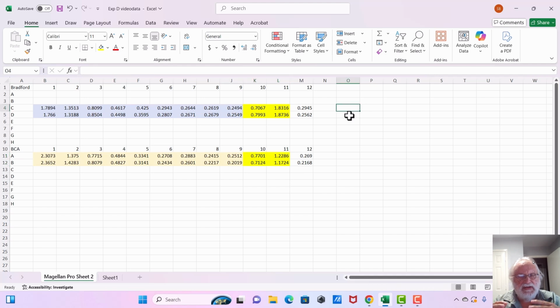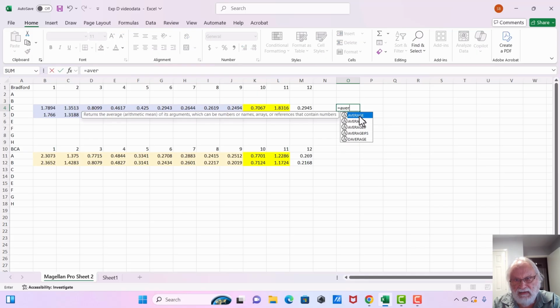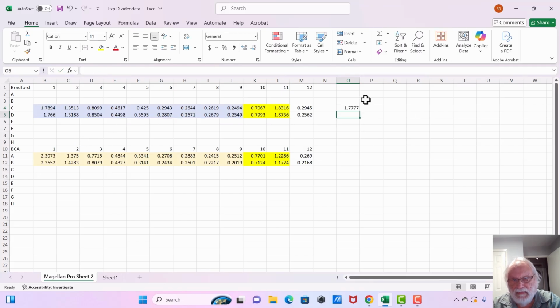What we did is we took duplicates of each one to help minimize some of the error. And taking means helps mitigate some of that. So we took means. So we're going to type in average in Excel and take the average of these first 2 values. What we also did was our standard, we started off with 2 mg per ml, 1 mg, 0.5, 0.25, 0.125, and so on. So let's go ahead and generate that part here as well.